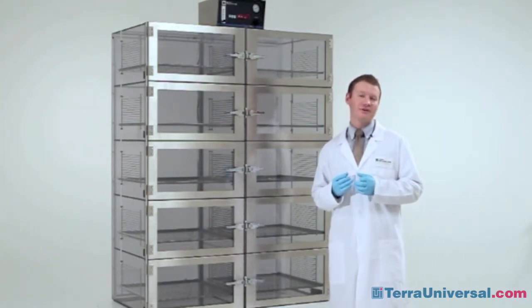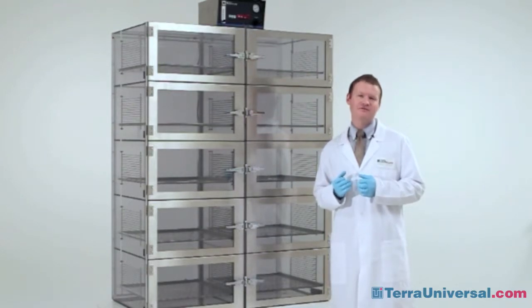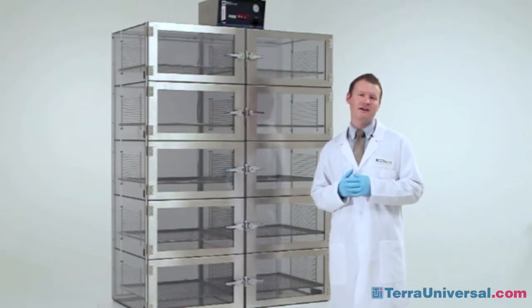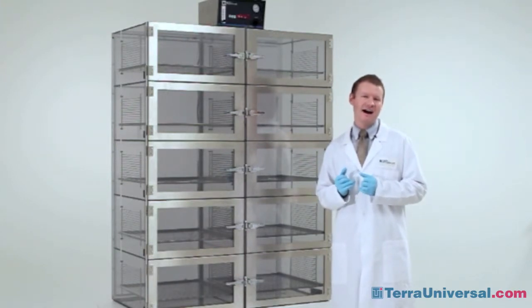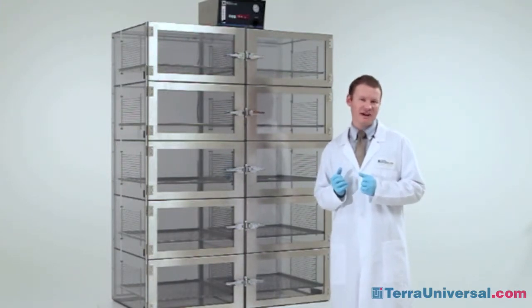Terra Universal can build a chamber out of transparent acrylic. The advantages of acrylic are it's economical, has a high level of rigidity, and it's transparent.